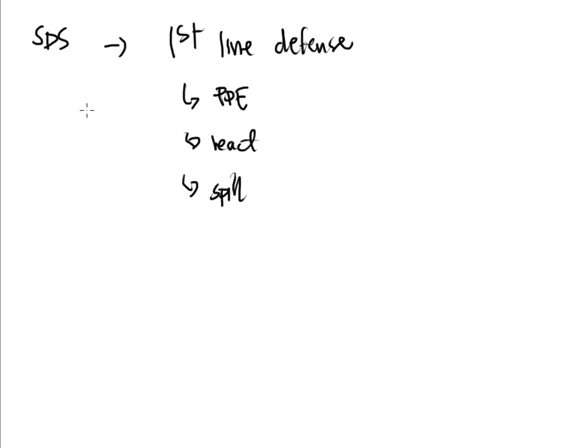We know it's going to happen. No matter how careful I am in a laboratory, something at some point is probably going to spill on the countertop or the floor. So the SDS would give me some insight about how to clean up that spill, whether it's a solid or liquid or even a gas.